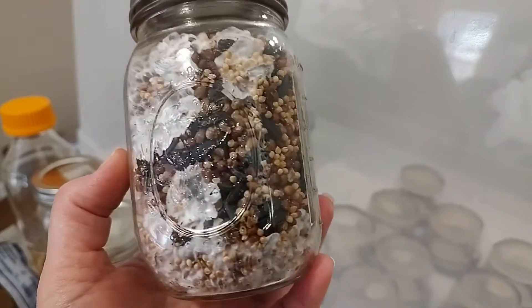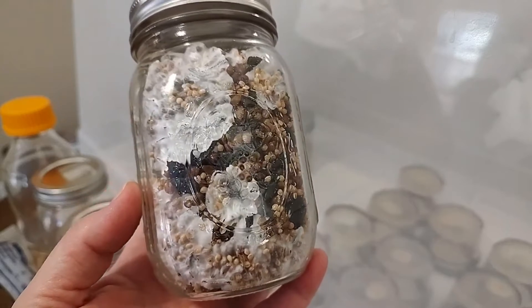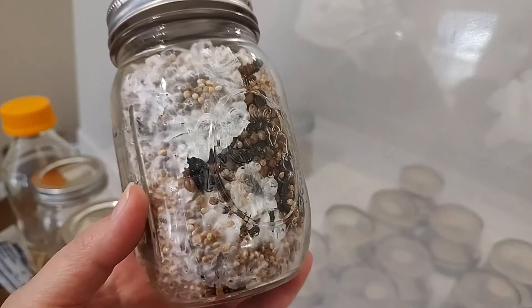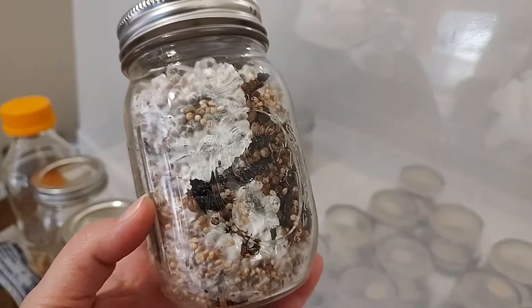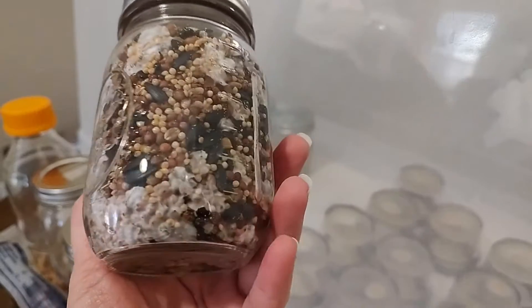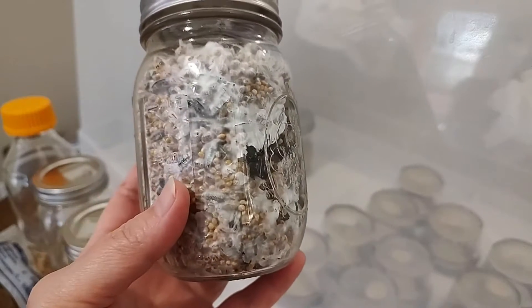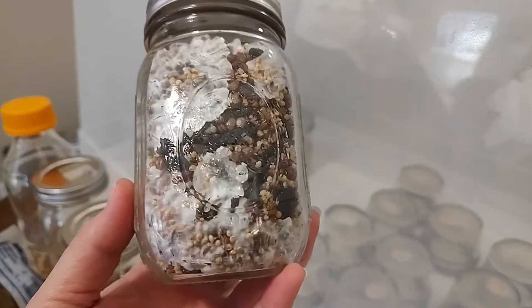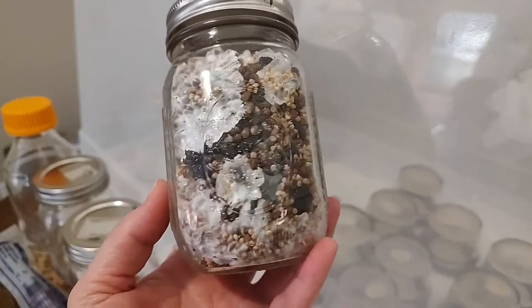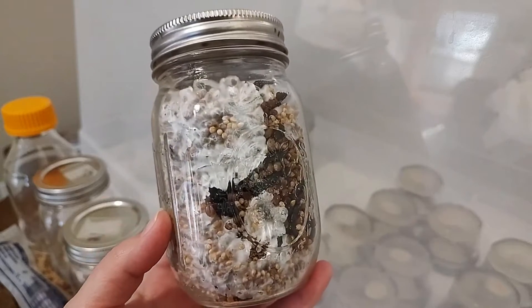I wanted to show you all the different methods and techniques so you can think through what would work best for you, because you have choices — there are so many choices, actually. There's not just one way. When you're working with spores, it has to go through germination and then to colonization, where you actually have mycelium.